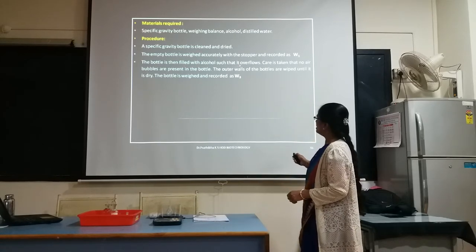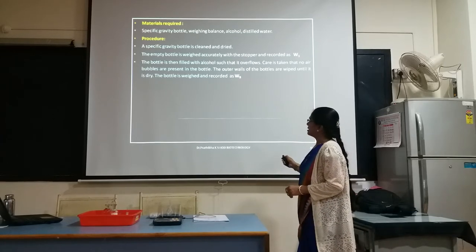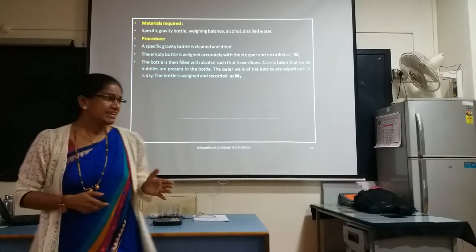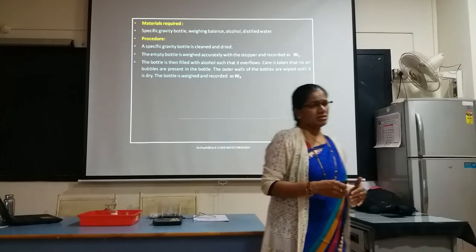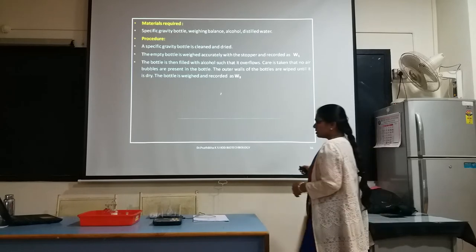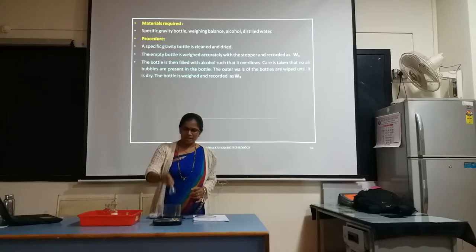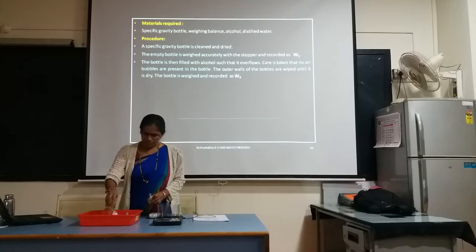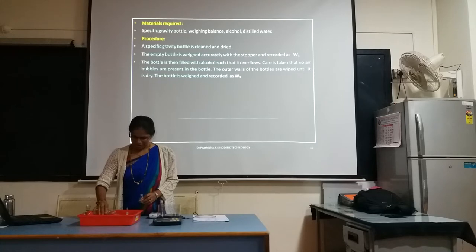The bottle is then filled with alcohol such that it overflows, and care is taken that no air bubbles are present in the bottle. The outer walls of the bottle are wiped until dry. The bottle is weighed and recorded as W3. So W3 is your specific gravity bottle along with the alcohol — the given sample. In the exam, whatever sample is given, you need to pour that. W1 is already recorded; now we will go for W3, for which you need to put the given alcohol sample.